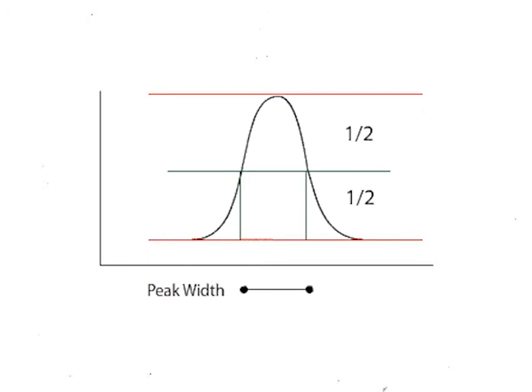Effect of the peak width. The width of the chromatographic peak as recorded on the chromatogram is the culmination of various phenomena taking place in the column. So, we will elaborate on theoretical terms related to the rate of movement of a solute down a column. Efficiency of separation can be attributed to the concept of height equivalent to theoretical plates, which is also called HETP or simply plate height.